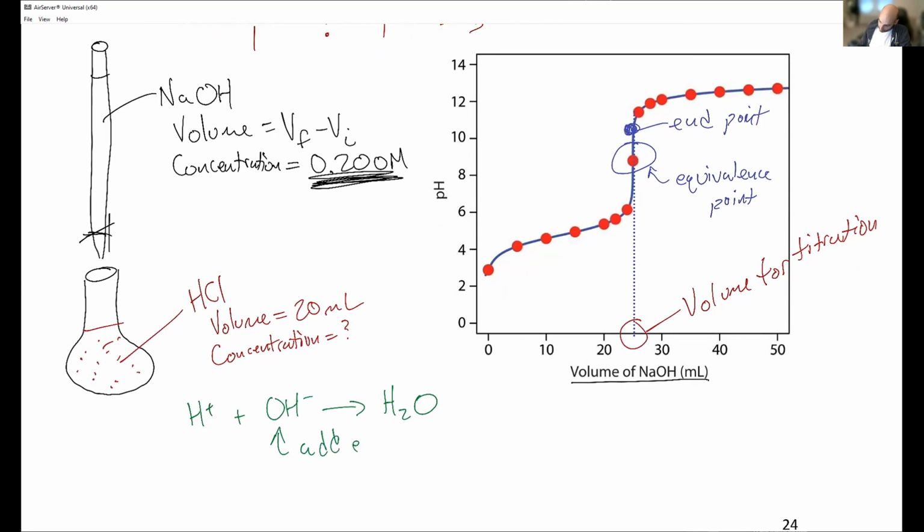As soon as I add extra OH minus, the solution will turn pink. Okay, so that's good. That's because I'm going to look at a solution endpoint, and this is not from a graph. This is going to be an endpoint, but it's going to be pretty close. So let's say that I end up with, I don't know, 100 base molecules before it turns pink.